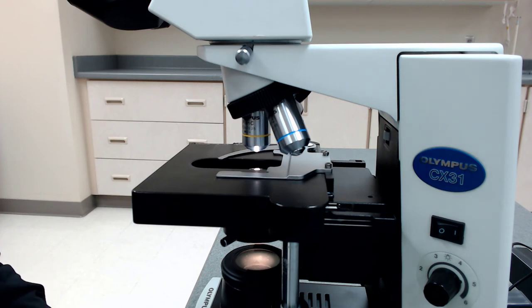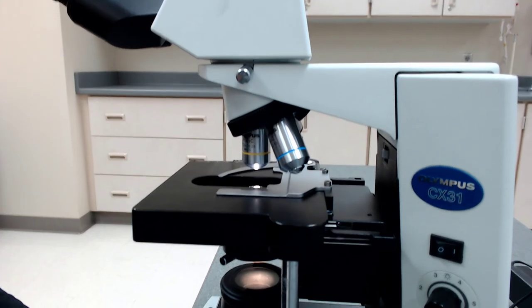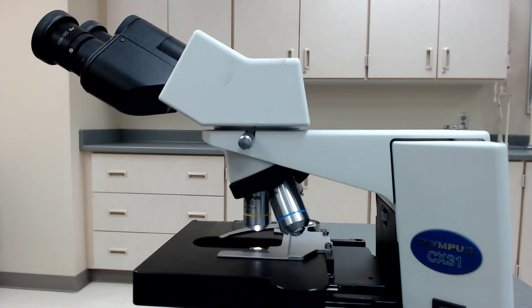But I'll cover that. I'll cover resolution and what it means with magnification in another video. I just wanted to cover the basic anatomy here of a microscope. I've created multiple videos where I show you how to use them and what to look for inside the microscope. But I just wanted to make sure that you got to see the outside once.